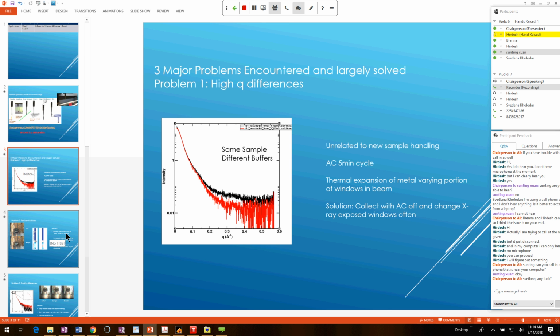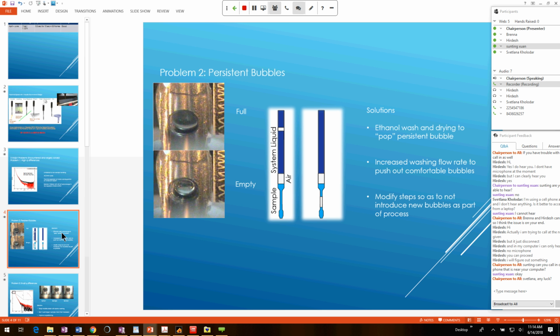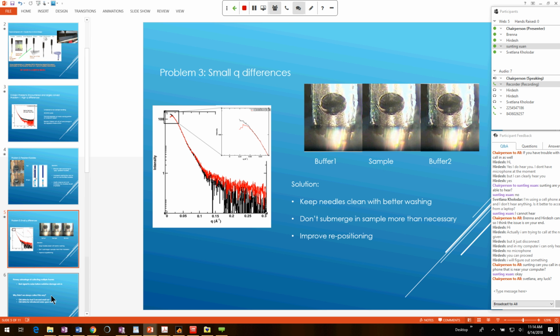We also had and have had bubble problems, and I think Svetlana's samples had some issues here, which we fixed by washing at every sample. But we supply an image of every sample inside the needle. Full should look like the top one, empty should look like the bottom one, and you will be able to scan through them, and I'll show you an example in a moment. This is a picture of the needle, and we just have bubbles sometimes creeping in, or it's not picking up properly.